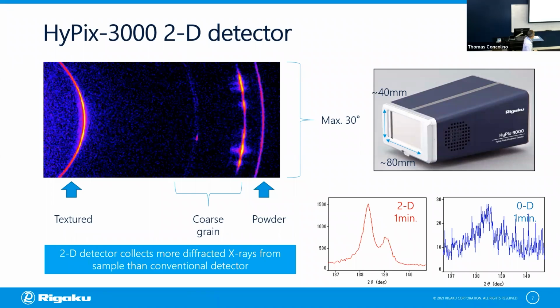But if your sample has coarse grains, you will see a spotty diffraction, though not like a single crystal. If you have a thin film or textured material, you see a non-uniform intensity distribution over the Debye rings. So by having the 2D detector, you get not only the phase information, but also texture as well. This is quite advantageous if you measure texture, of course, and residual stress as well, because sometimes you may have some difficulty finding the peak.